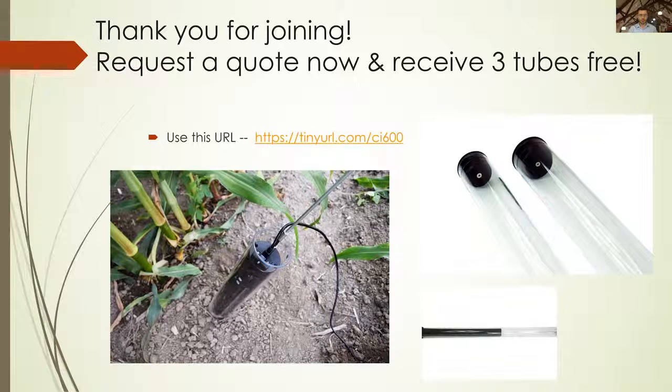The next question is, can the image analysis software recognize roots? Traditionally, it has taken a long time to manually select roots and measure the lengths in images taken at certain time intervals to get root growth. Again, with the image analysis, we have developed the automatic selection a little bit, so you're able to start the selection and then just click automate, and it will continue on through the similar size pixels. Once the pixels get too different in their coloration, brightness, intensity, it will stop. But if that is not exactly on your root, you can really quickly just point, drag it over, and it'll snap back into place.